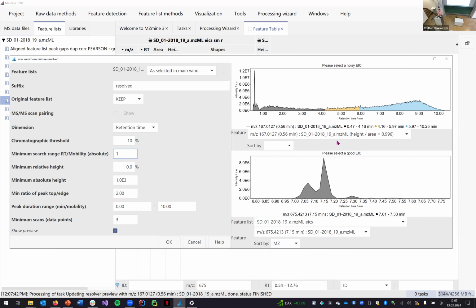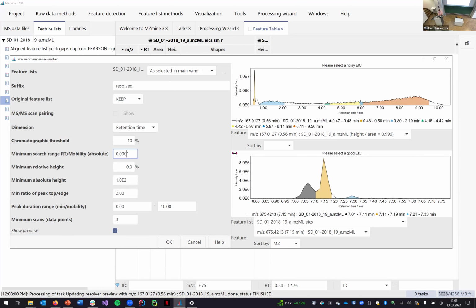It doesn't detect the peak. If we put something really, really small, it's not small enough, I think. What I want to stress is that this one here stops early, so it doesn't cover the full area. Did you come up with an optimum value? What worked best for you?